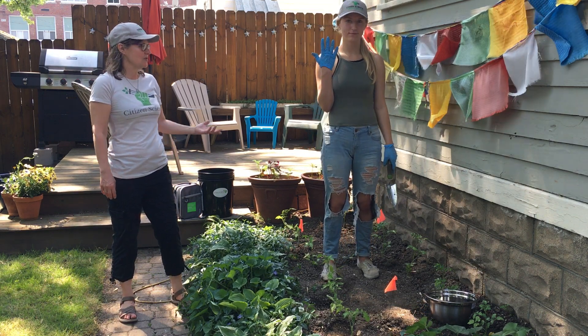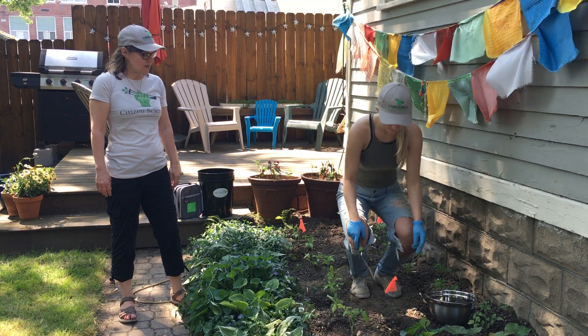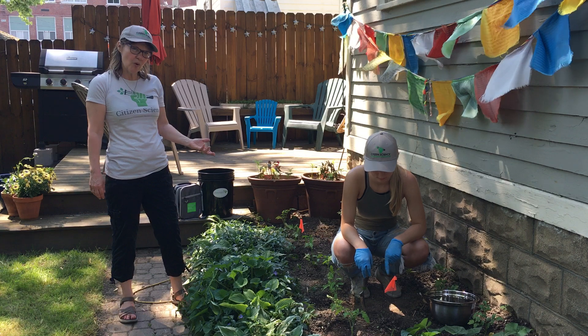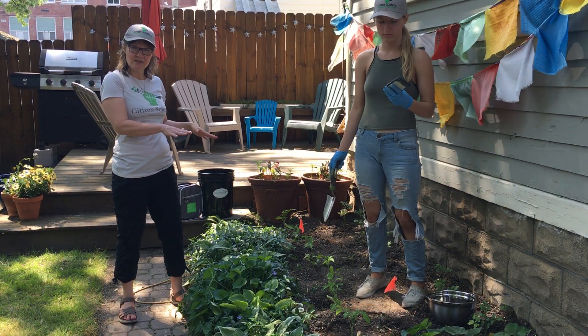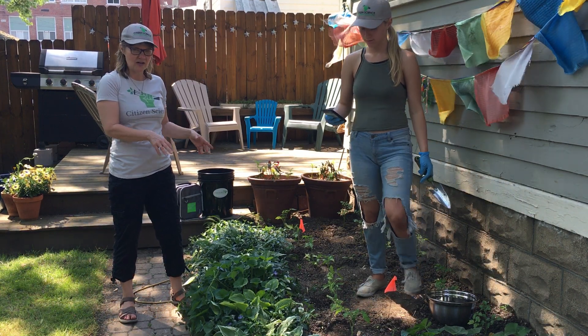The first thing you do is put on gloves. The next step is to choose the points in your garden. It's a three-point random sampling, so you want to disperse the points in the garden using a V-like shape, which you see right here.